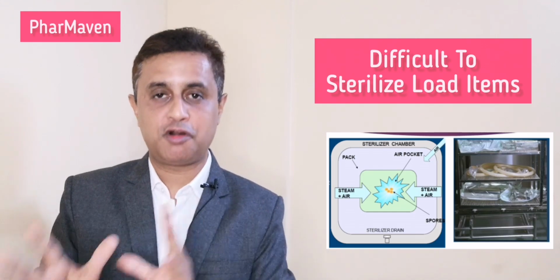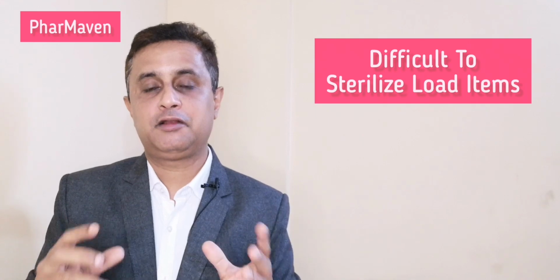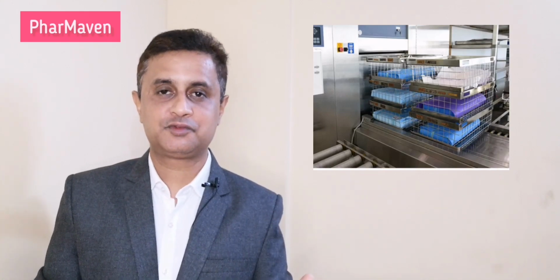If you have vessels, bottles, then it is possible that the bottle cannot be penetrated by the steam, so it becomes your difficult to sterilize item. Then comes your load placement. Another question is, how do you define your load placement and how do you ensure that it is followed in the routine? For load placement, we have to see that the heavier items in the load are kept at the bottom of the autoclave chamber or bottom of the shelves.